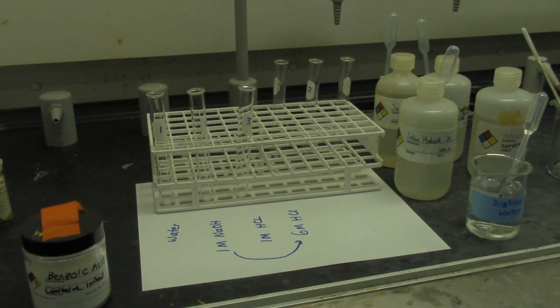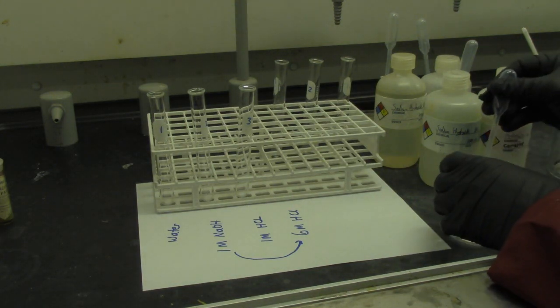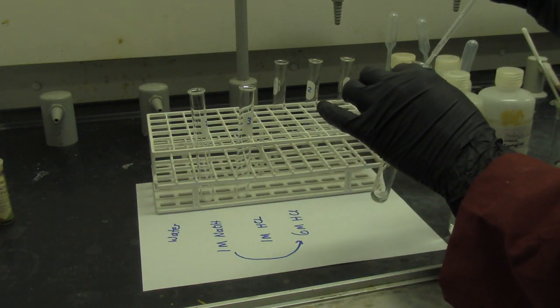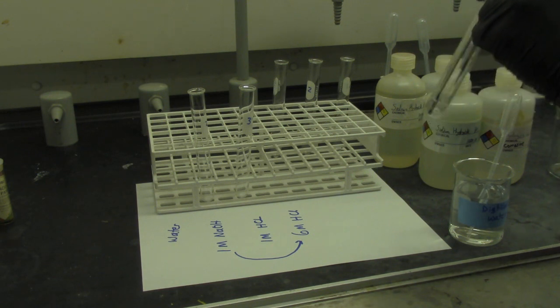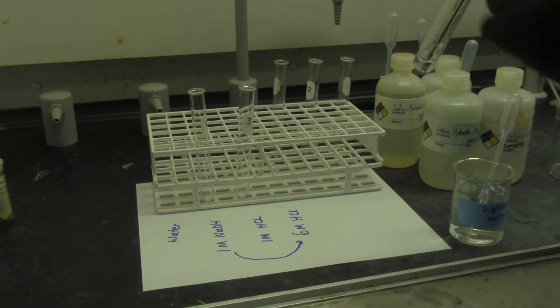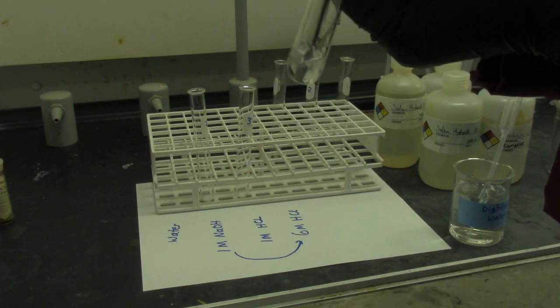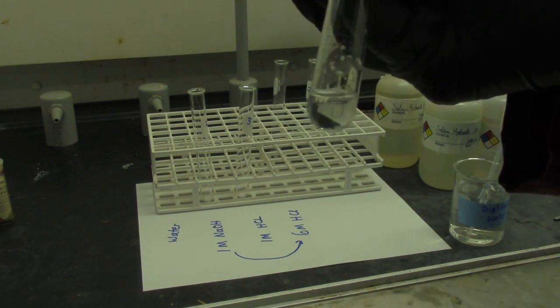I placed 30 milligrams of benzoic acid in each test tube. So first test tube, I add 1 ml of water, stir for 20 to 30 seconds, and note down the observation.